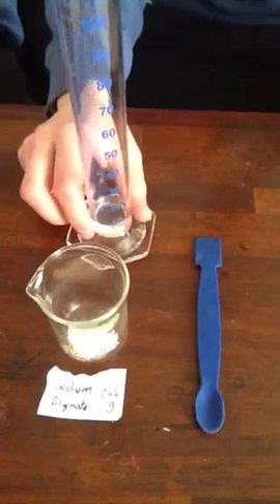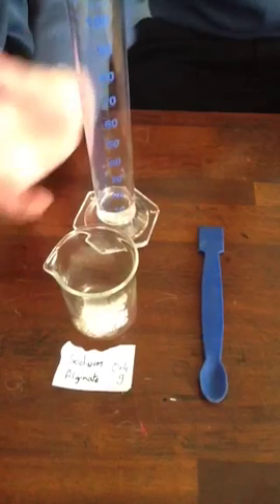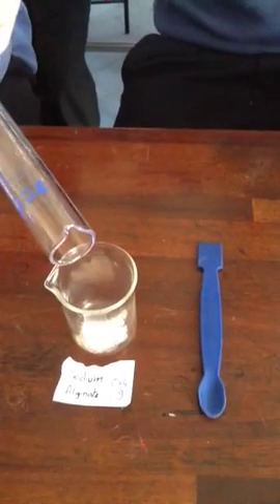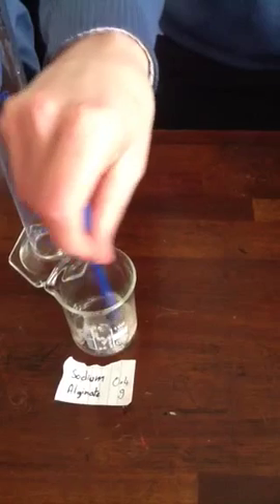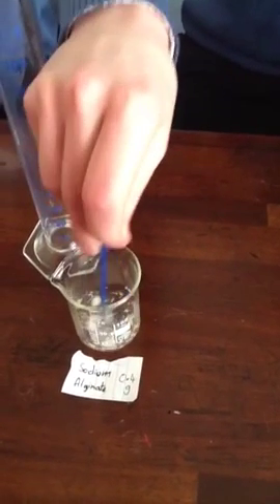I'm going to add 10 centimeters cube of water into the 0.4 grams of sodium alginate. Good man. And what do you do with it now? Dissolve it. So we leave you there dissolving that.